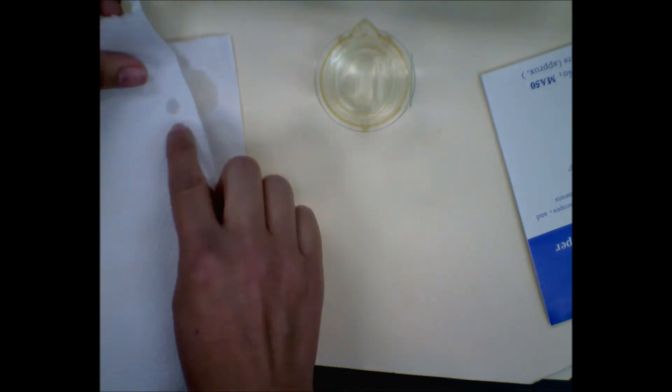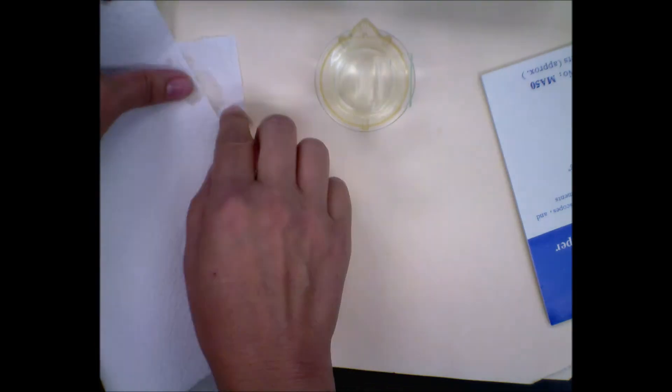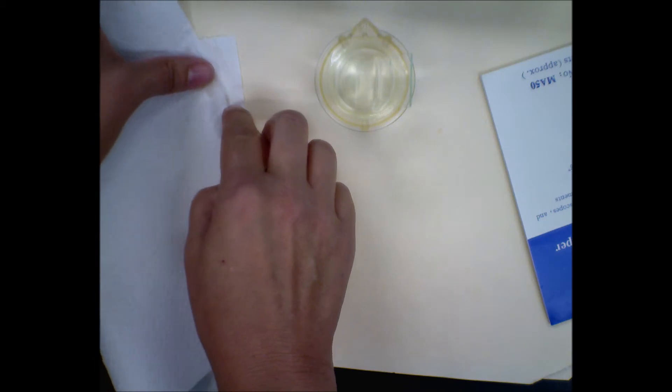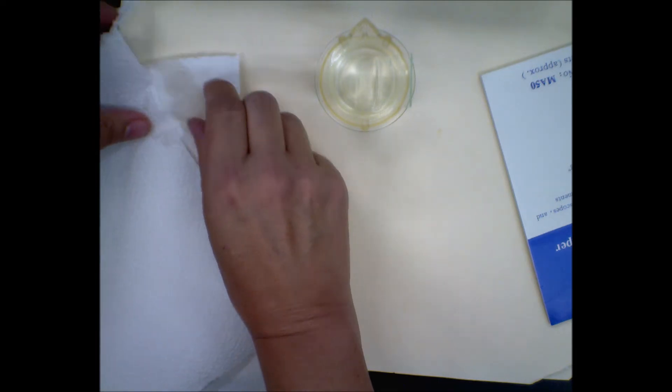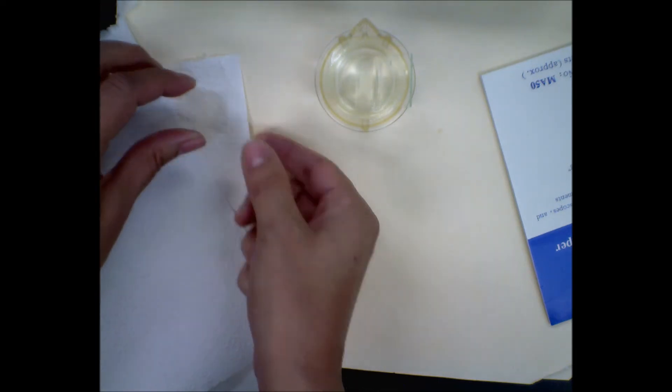Now, we said earlier that lens paper is the correct way to clean slides, and that's true, but you don't want to use all your lens paper up getting the gunk off. Use the lens paper for getting off the fuzzies and the last little bit of water.